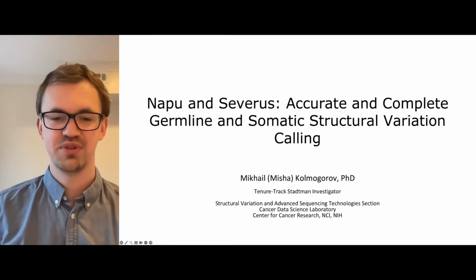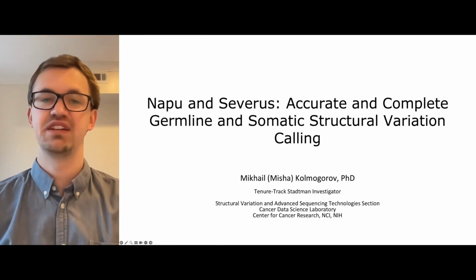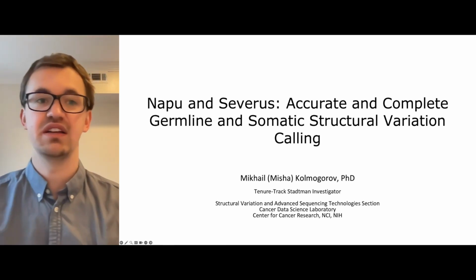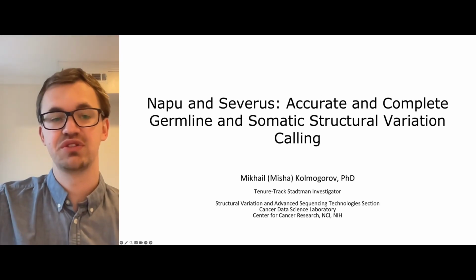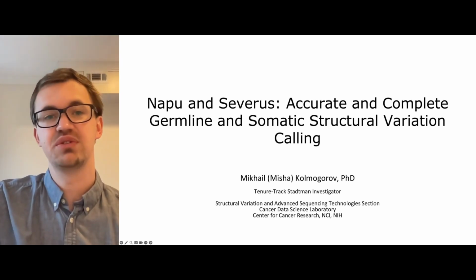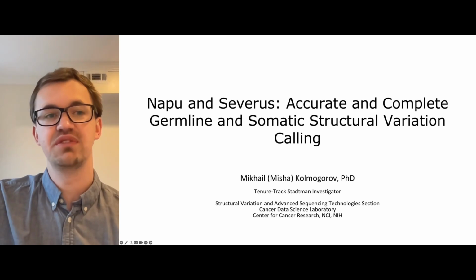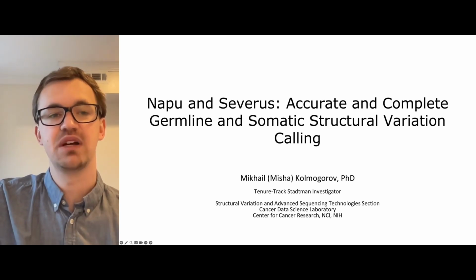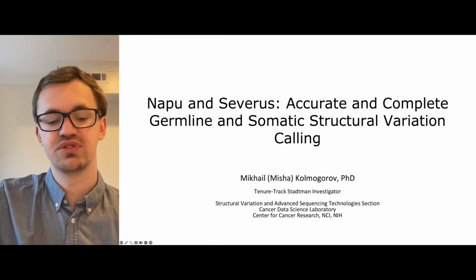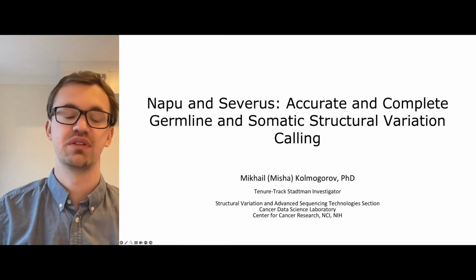Thank you, Pascal, for the kind introduction. It is my great pleasure to be here, and thanks a lot for inviting me to present this work. In this talk today, I will be talking about structural variant analysis in 2 different contexts. I will be talking about germline structural variation and how we can analyze it using the NAPU pipeline. And in the second part of my talk, I will focus on analysis of somatic structural variations with Severus.